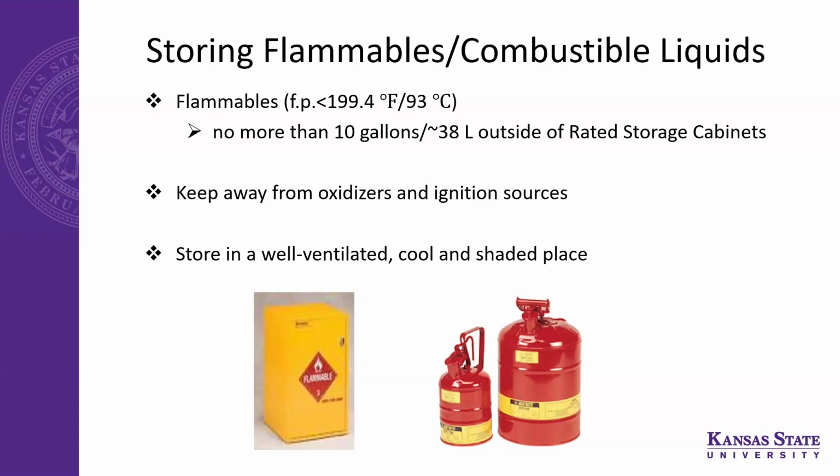But sometimes in the loose literature, they mention that they have to be 20 feet away, or one should be in the fire-rated cabinet, then you can make it close. I personally want more than that because I have to work for many years in the future with this setup. That's why good knowledge is better.